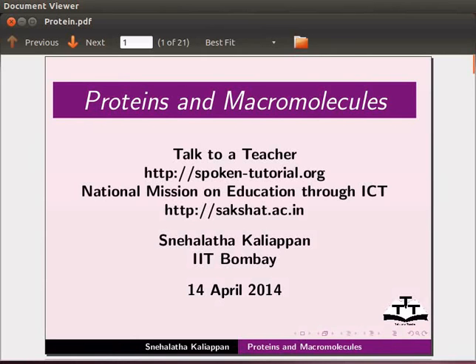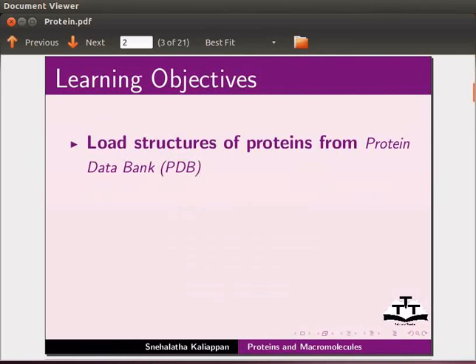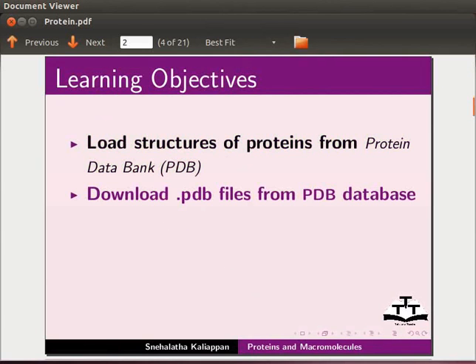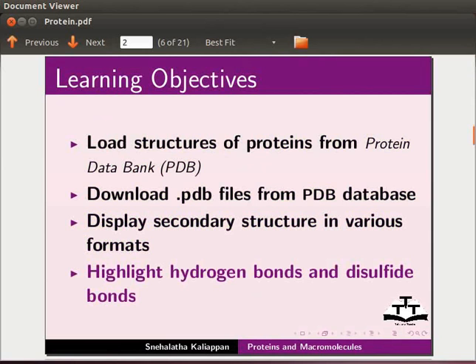Welcome to this tutorial on proteins and macromolecules. In this tutorial, we will learn to load structures of proteins from protein databank, download .pdb files from pdb database, display secondary structure of proteins in various formats, and highlight hydrogen bonds and disulfide bonds.